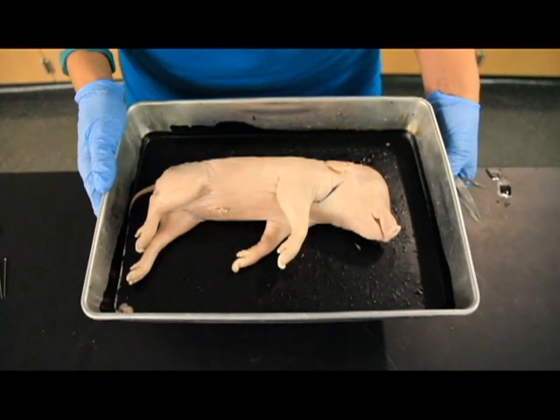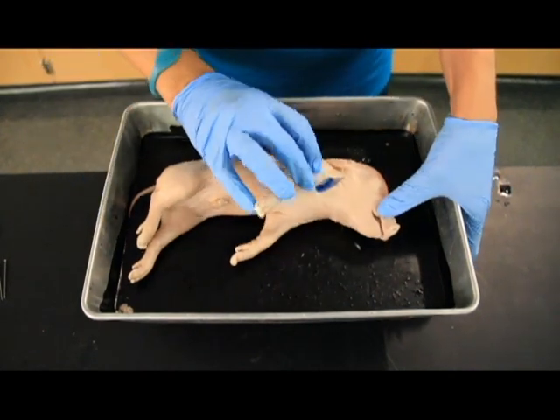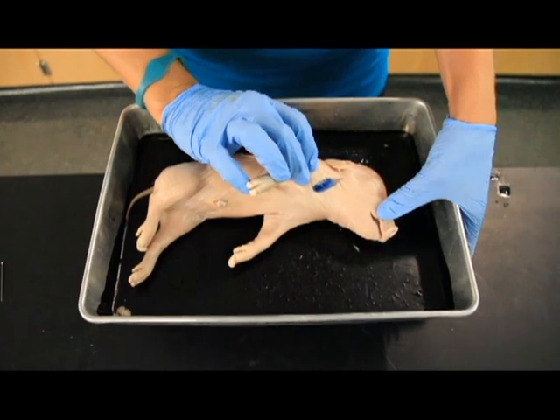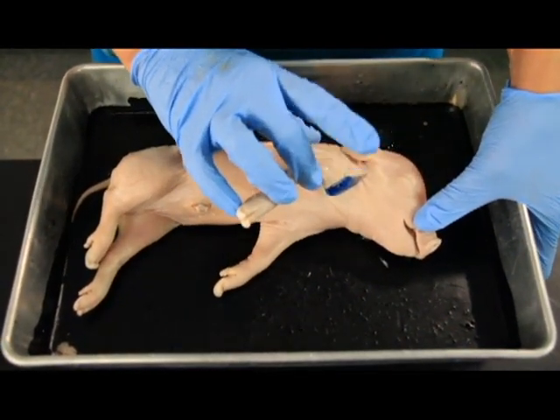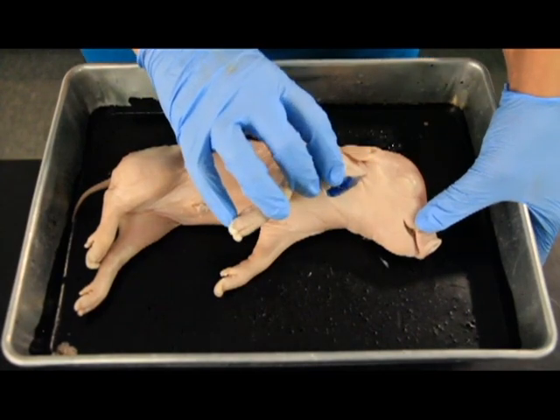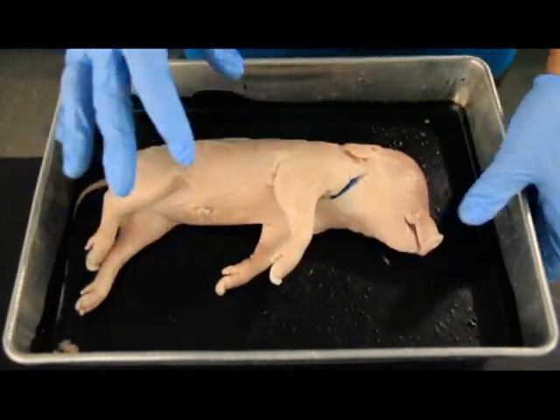Okay, so next we're going to move on to the cheek dissection. And where you want to start with the incision is they're already going to have this large incision in the neck. And we really want to start there. And this incision was made because they inject blue into the veins and red into the arteries. So that'll help you once we open this guy up to determine which one is which.